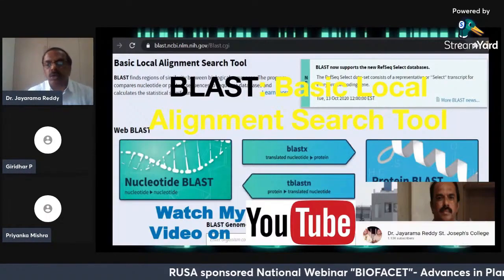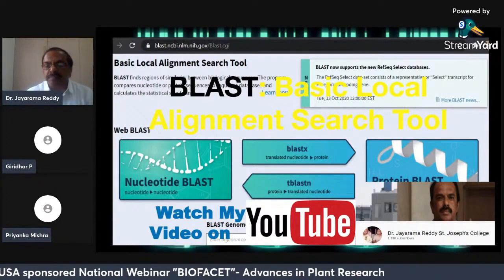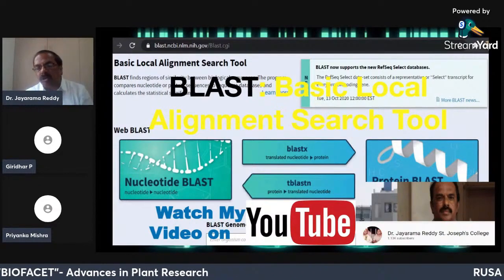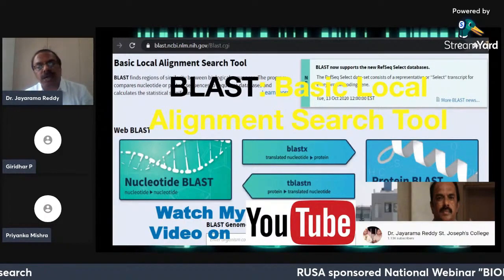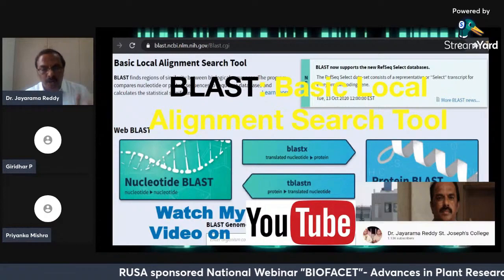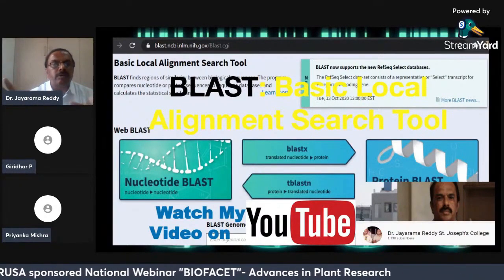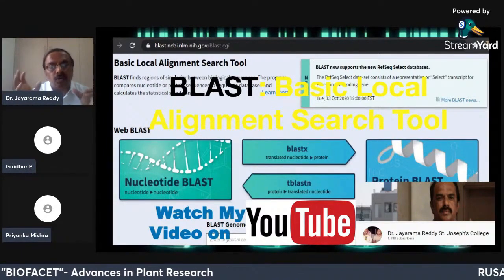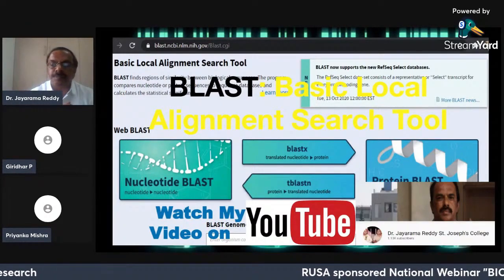This is BLAST. This is the home page of BLAST. I have made several videos on bioinformatics. You can go to my YouTube channel, which is in my name only. You can just type in Google Dr. Jayarama Reddy YouTube channel. I have more than 210 videos, so you can watch them if you want more information about how BLAST is done, what technology is involved, and how comparison is done.